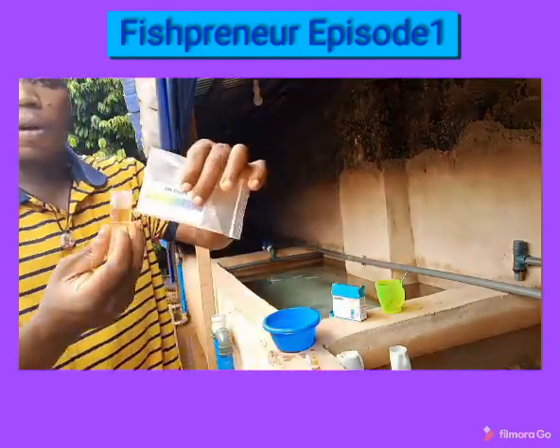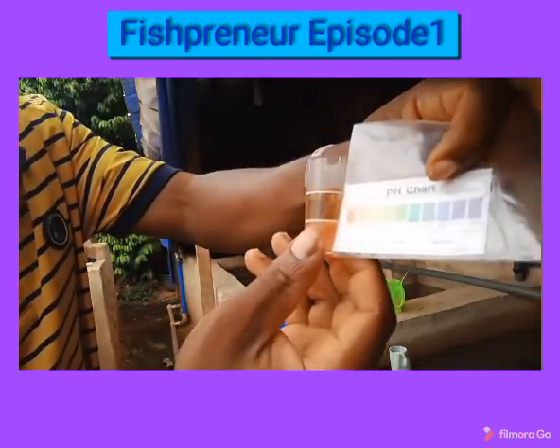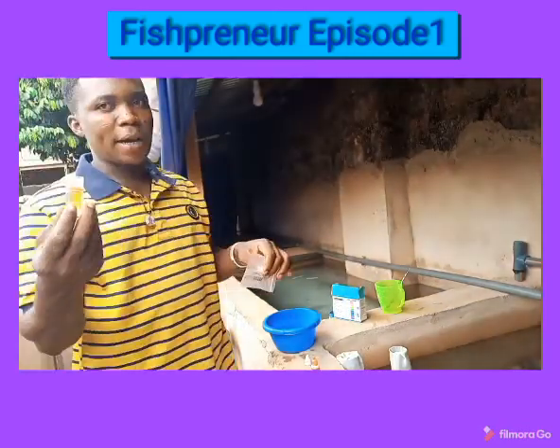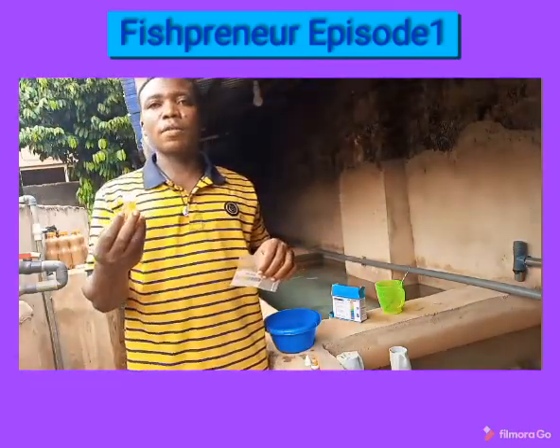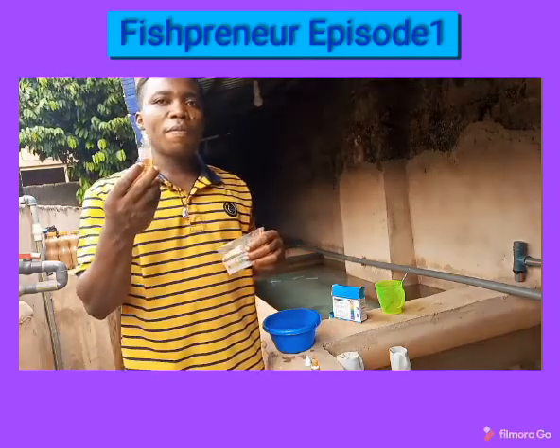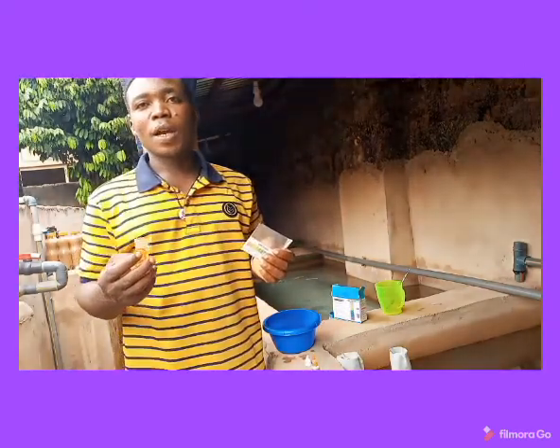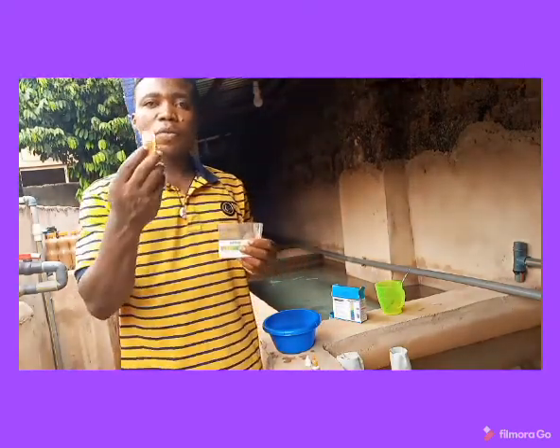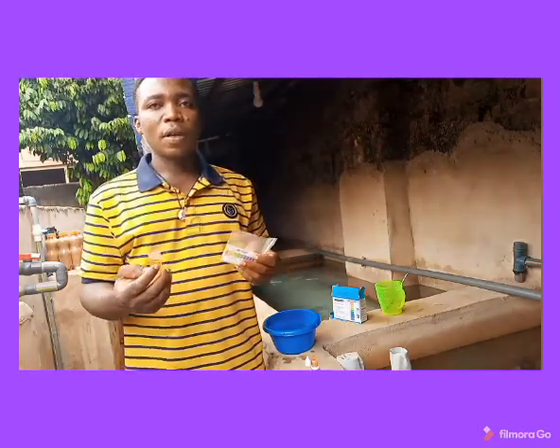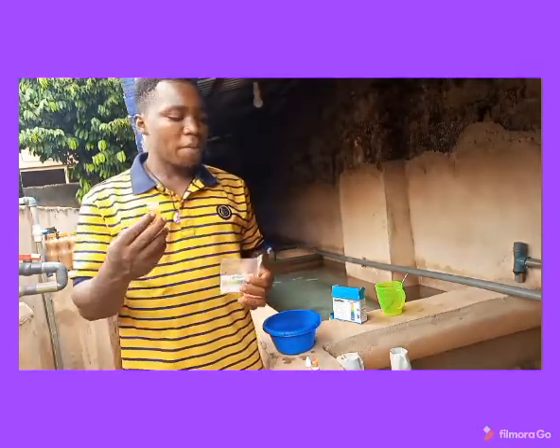Let me come closer to the camera. When you check this color, you can see that what you are having here is 4.0 — and a pH of 4.0 is very, very bad. I am telling you that if you make use of this water to raise your fry, they will find it very difficult to survive. They are going to experience acid burns. In fact, this water is not good for raising even table-size fish — that is why you see some fish with burning fins and burning bodies, because of poor water quality.